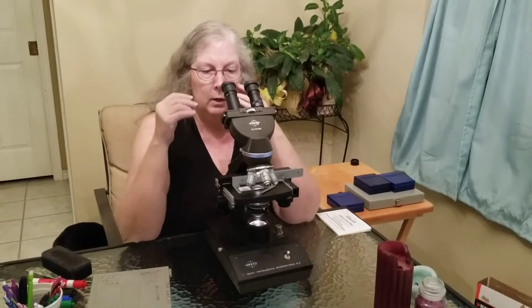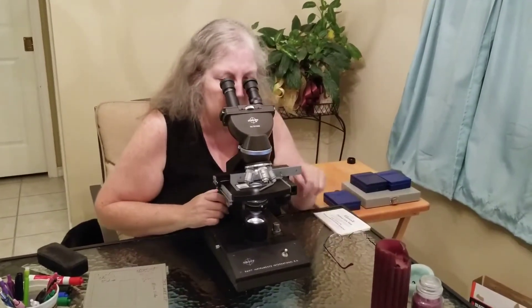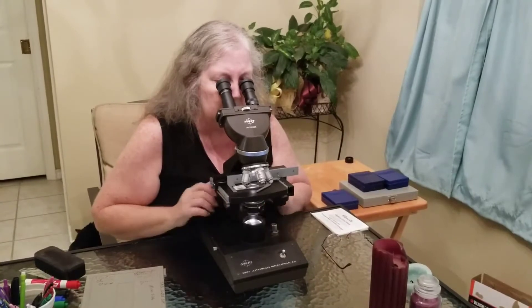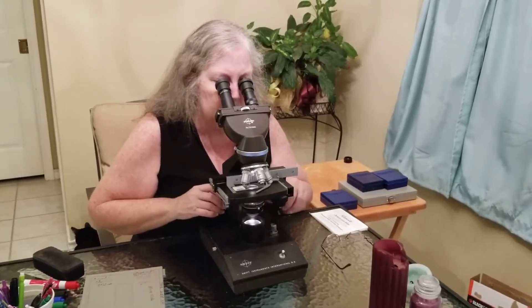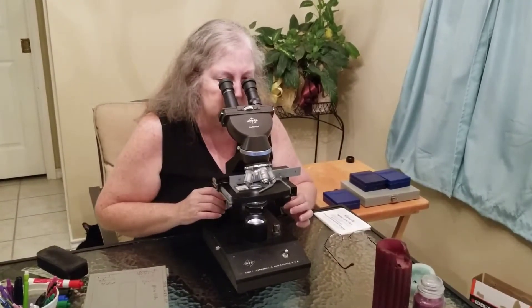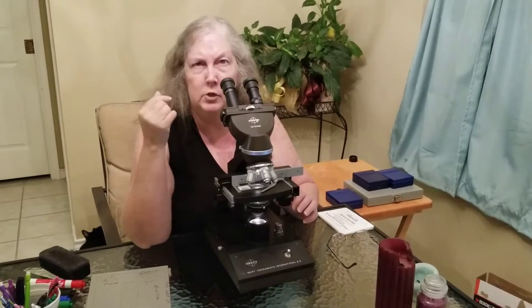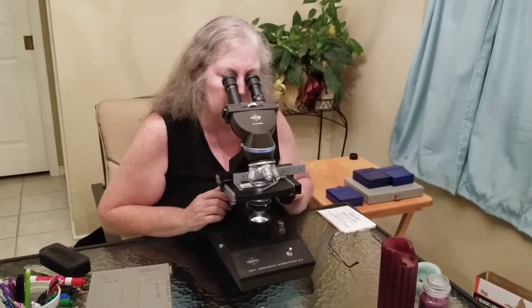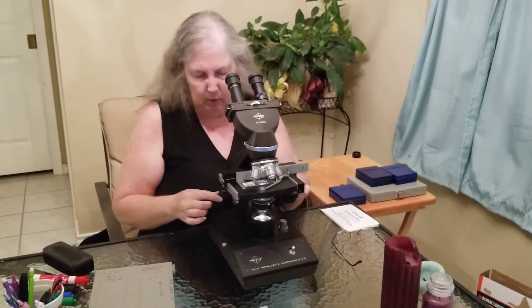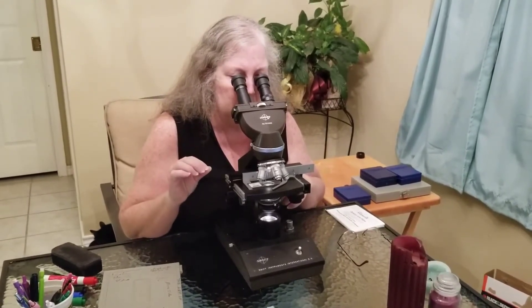You always want to start with the lowest objective, which has the largest field of view so you can scan more area at once. If you wear glasses, you can keep them on or take them off — whatever works best. Use your coarse adjustment to move down until you see something, and you may have to move the slide a little bit. One of the eyepieces will often have a pointer in it, which is helpful when working with someone else. Use the coarse adjustment to get it in focus, then use the fine adjustment to get a really nice crisp, clear focus.